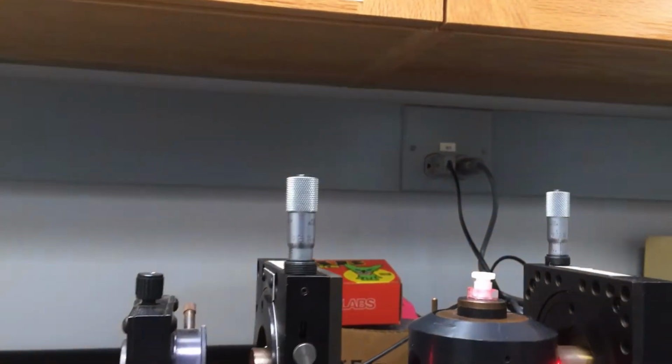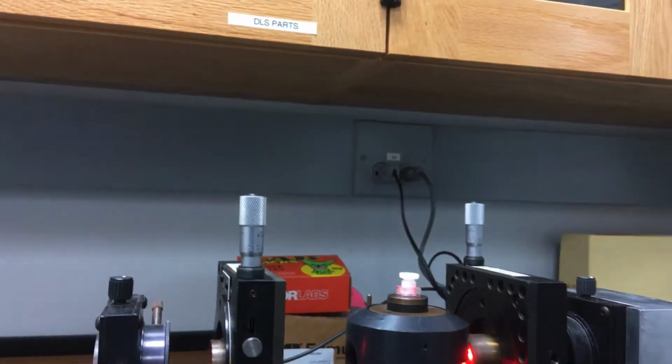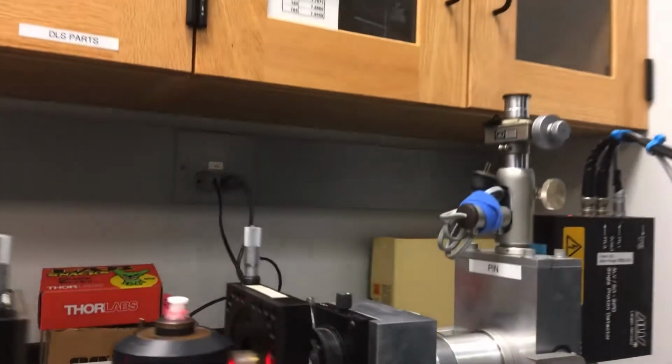And then there is a crossed polarizer, and the alignment scheme is to set that thing to horizontal first, and that's the whole trick to doing this, is to get that one horizontal. And that's a long explanation. We aren't going to talk about that. And then after that, we have the detector, the same as before.